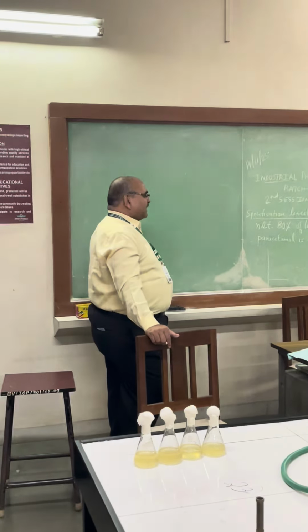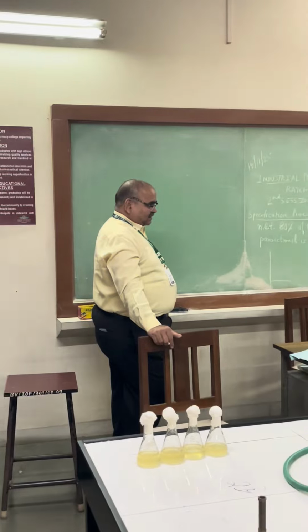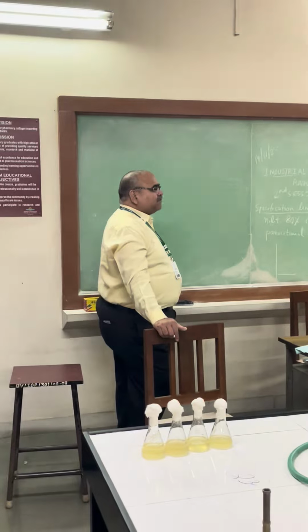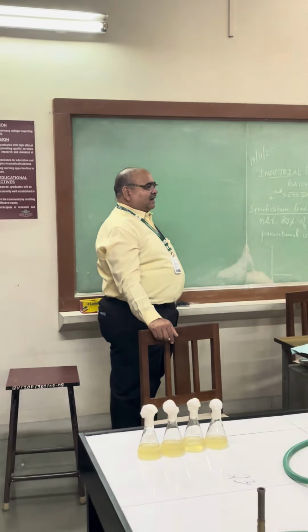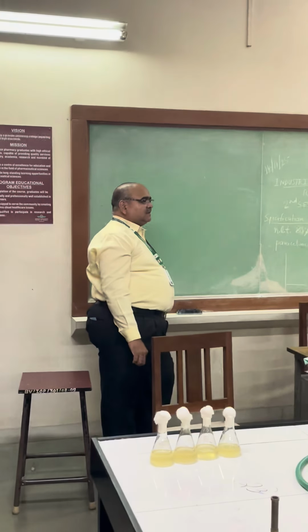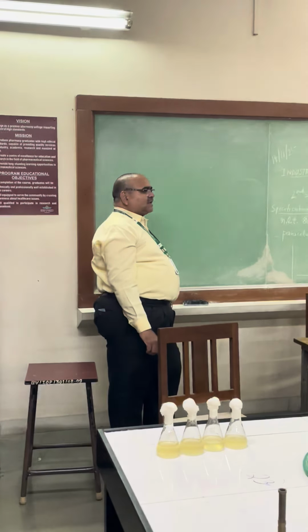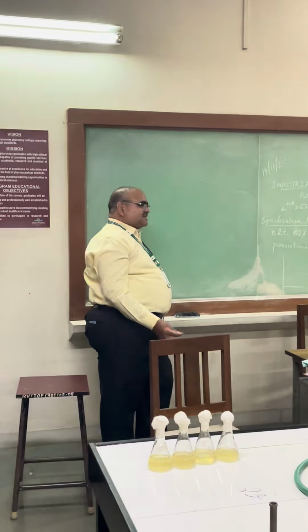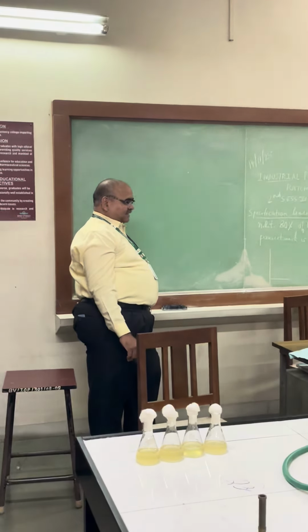Among these 8 to 9 tests, the second test is called the iodine test, where you test the sample solution which is given to you with the iodine reagent. After addition of dilute iodine solution, when the sample solution gives blue coloration, you will come to the conclusion that polysaccharide, that starch, might be present. The same principle is used here in case of the amylase test.